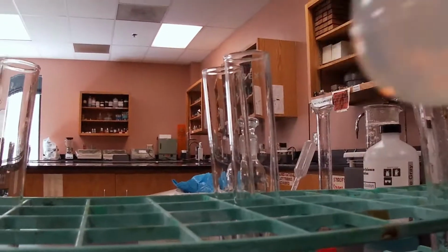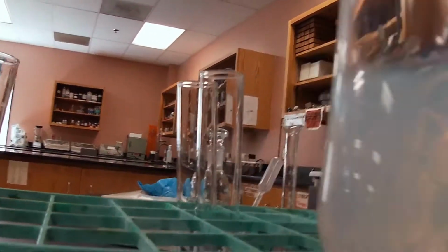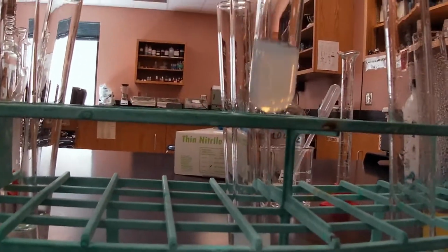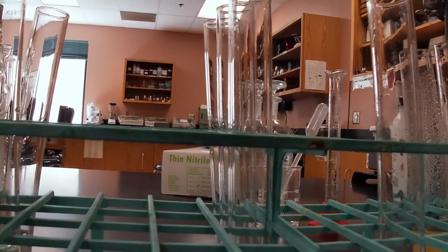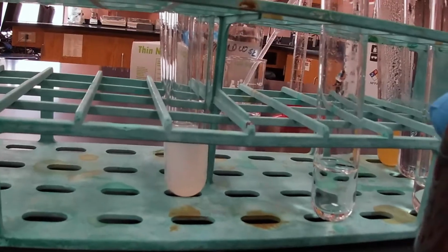Do you see some fogginess again? And those are some fogginess too. This one, once I added my silver nitrate, so we'll put our contents over there.